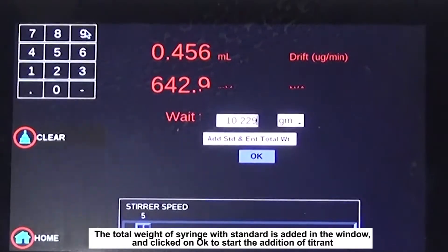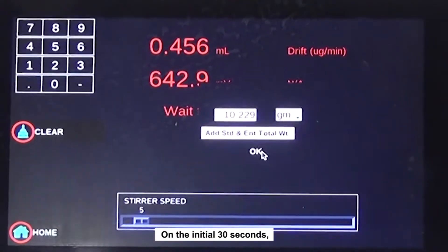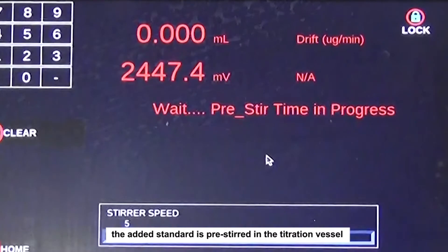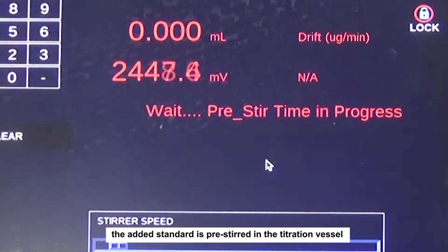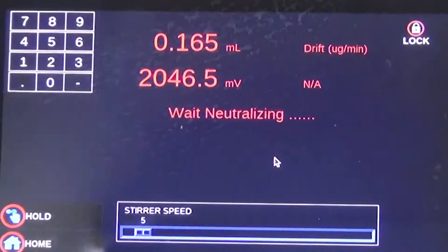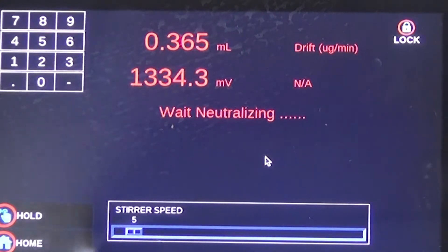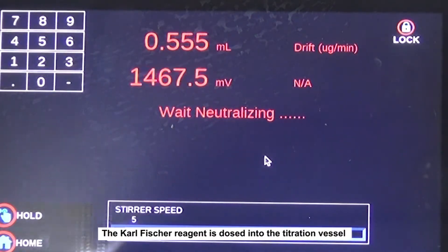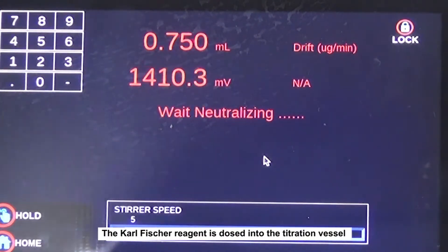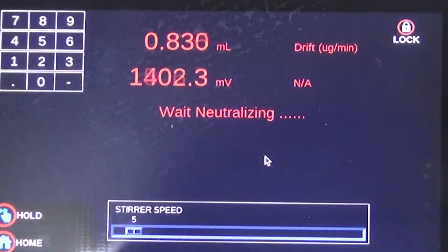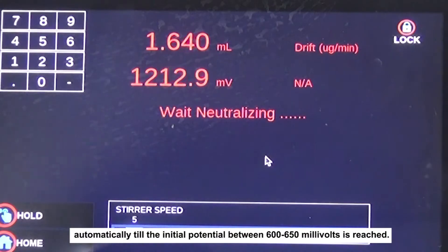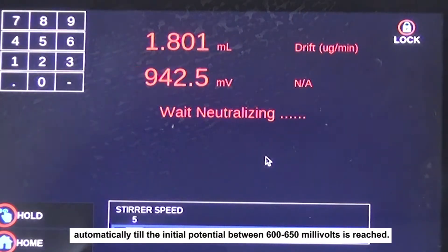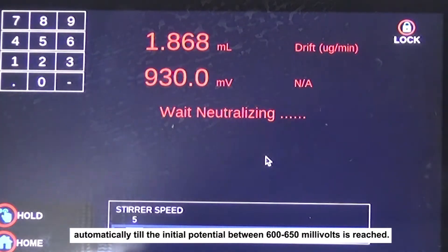In the initial 30 seconds, the added standard is pre-stirred in the titration vessel. After stirring, the Karl Fischer reagent is dosed into the titration vessel automatically until the initial potential of 600 to 650 millivolts is reached.